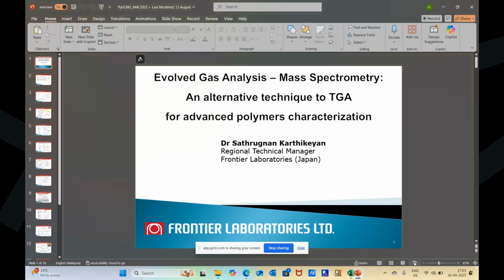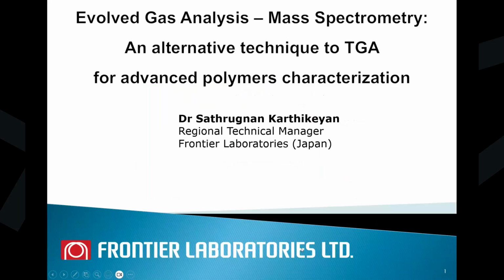Okay, so let me start. The topic for my sharing today is evolved gas analysis mass spectrometry, an alternative technique to TGA, the thermogravimetric analysis, particularly to see what EGA-MS can offer compared to TGA for advanced polymer characterization.